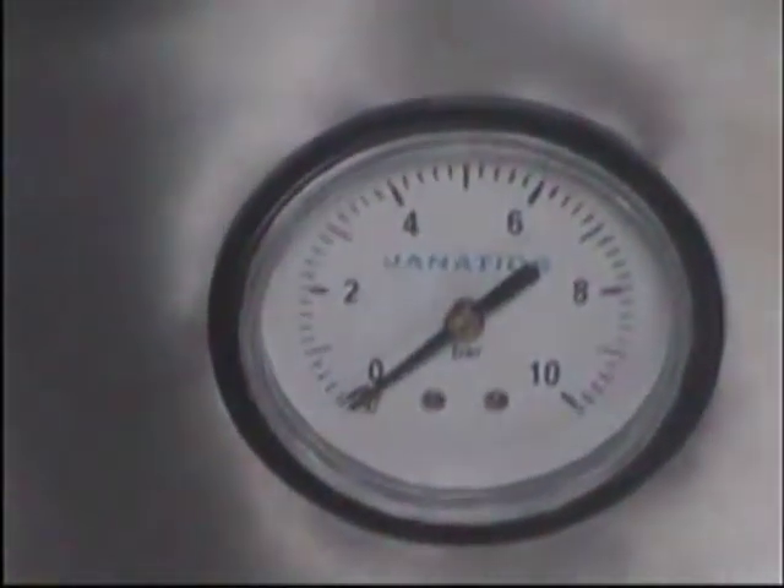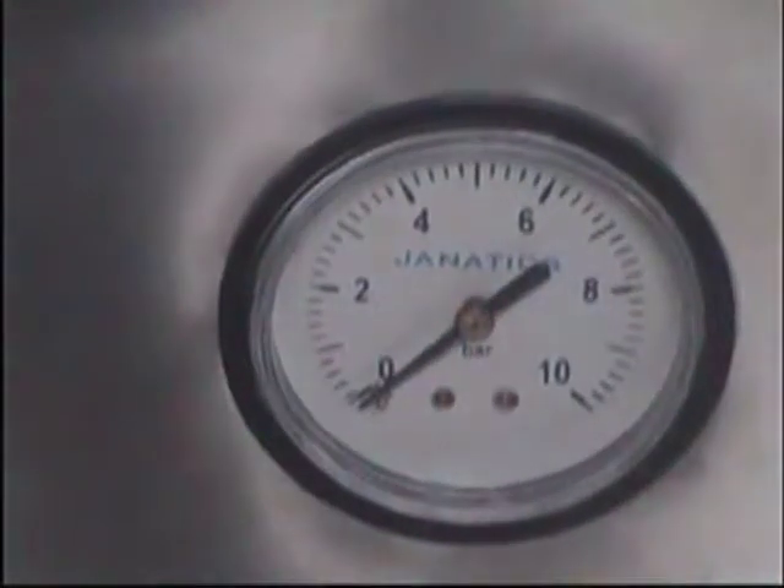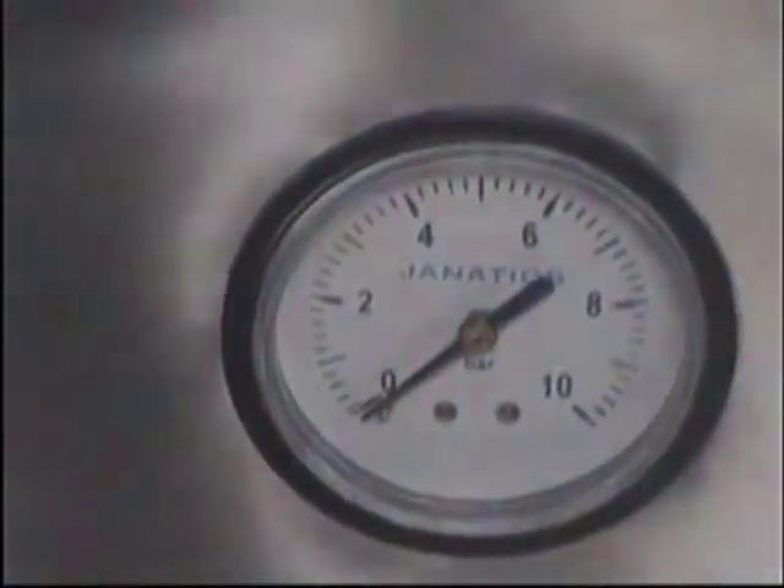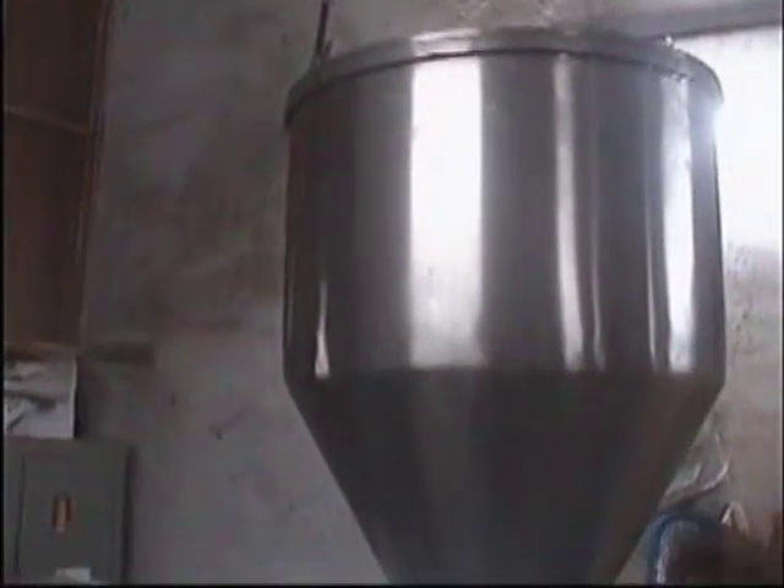This is the pressure indicator. Your compressor pressure should be around 6 kgs. You are seeing the hopper, in which you can load your ointment from 25 to 30 kgs.